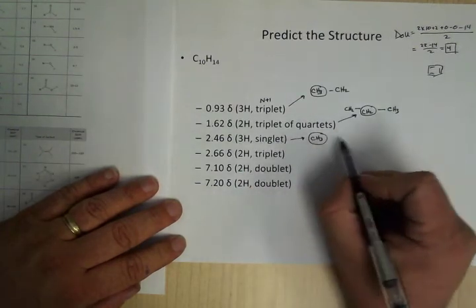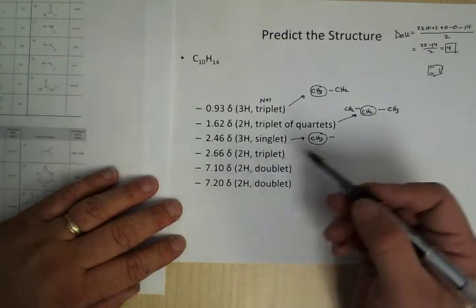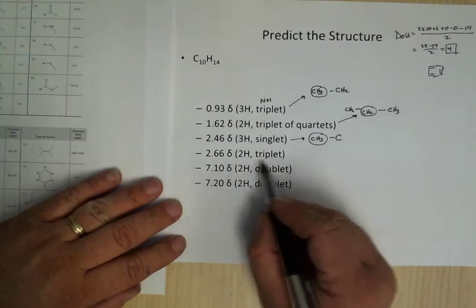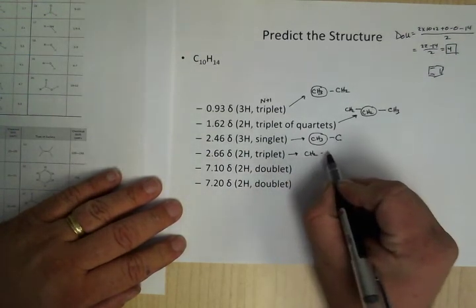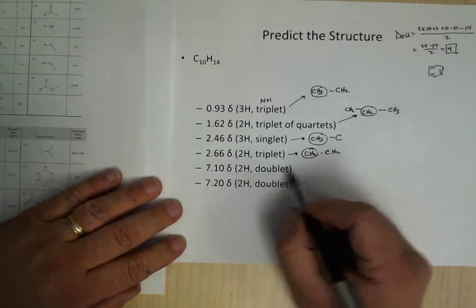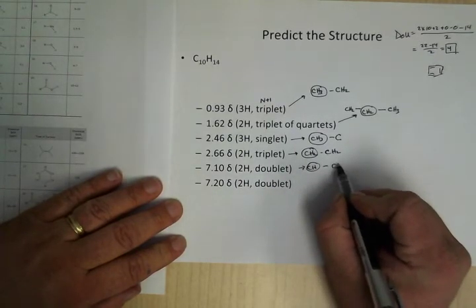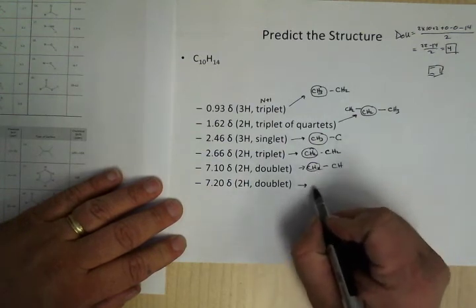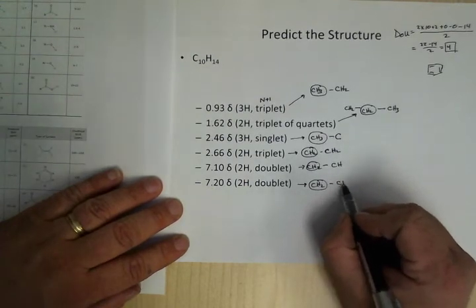But it's a singlet, right? So n plus 1 equals 1, well, then you can't have any neighbors. So here again you have a CH2, a triplet, so it's next to a CH2. Here you have 2 hydrogens right next to a doublet, so a CH. Here again you have a CH2, 2 equivalent hydrogens, right next to a CH.